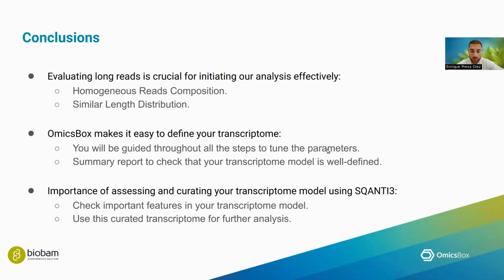It helps you a lot to tune your parameters, also because of the summary report and the charts. And finally, I also want to remark the importance of assessing and curating your transcriptome using SQANTI3 with all the features that we have spoken about. And it is important to create your transcriptome before moving on with downstream analysis.